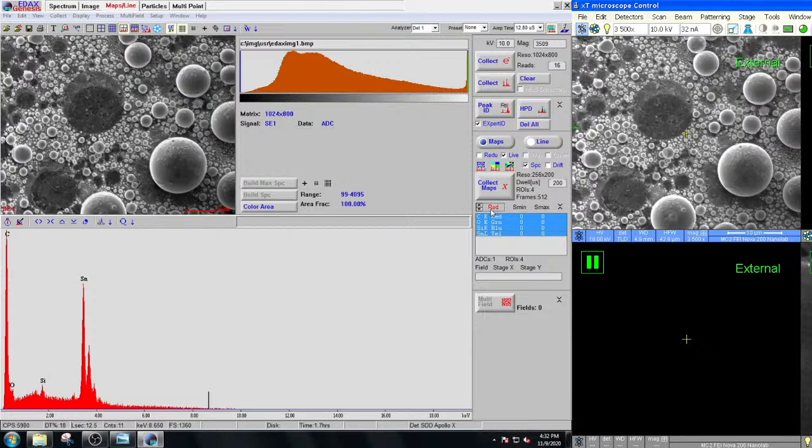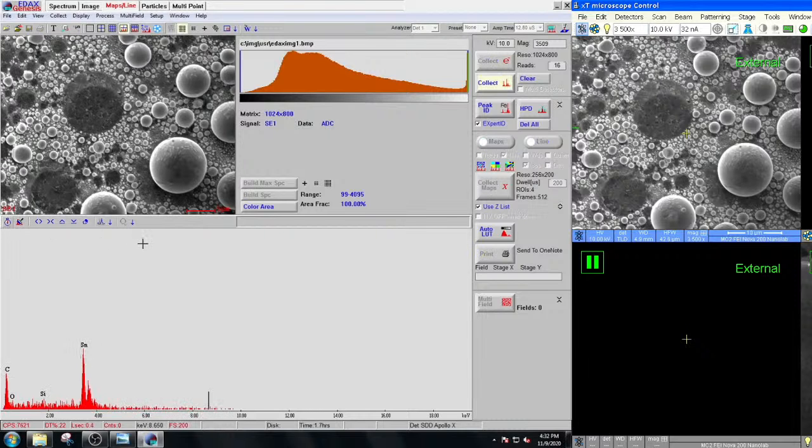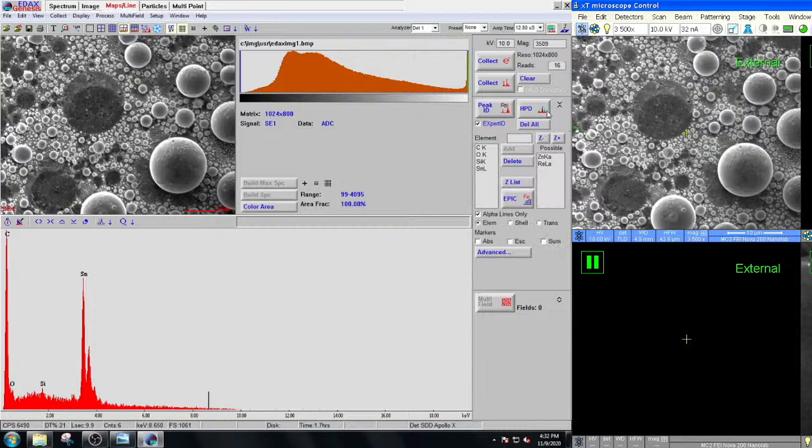If you don't do it that way, the other way to do it would be to clear your spectrum and hit the little stopwatch, and you can collect the spectrum. The same tools that you use in the Image tab work here, so you can do points, you can do reduced area boxes on things. You can collect the spectrum, and then you have to ID, where is it? Here, the peak ID. So you can run your peak ID, put in the elements that you want here, same idea. It just saves you some steps. Remember that if you already got the spectra from this sample, you can just import it from the other tab, and you don't have to do it again.